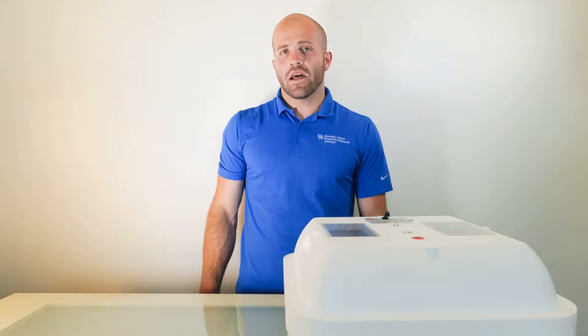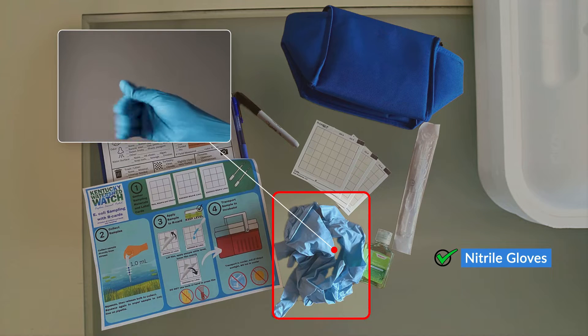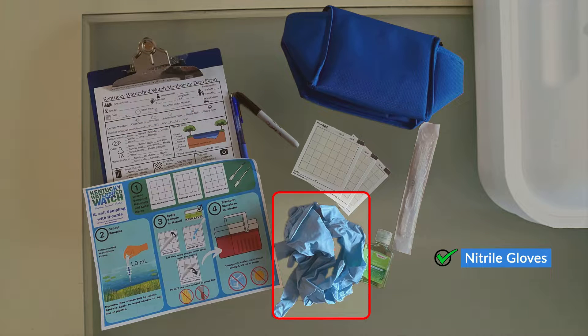Before we go out, let's talk about the supplies we need to bring. The first item on our checklist is gloves. Gloves should be worn to prevent the sample and our R-card from being contaminated by substances or microorganisms on the hands of the person collecting the sample. This is important for maintaining the sample's integrity and ensuring that the results of the test are accurate.